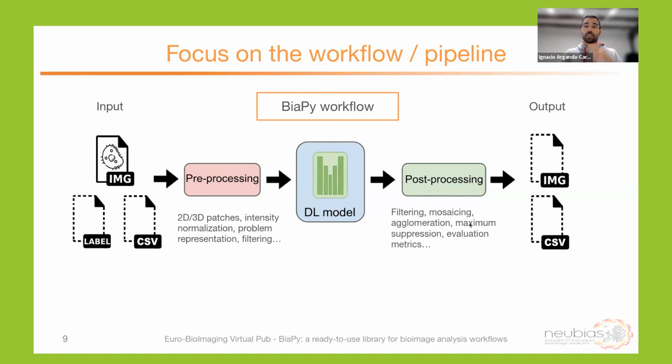And post-processing, as I said, there's a lot of things that we can do. Here, actually, the analysis is also performed in some cases. We have post-processing filtering, but also, very importantly, how do we do the mosaic of the different patches out of the input patches, or we have agglomeration methods, non-maximum suppression methods for detections or segmentations that are nearby, etc. And plenty of evaluation metrics, and we spent a lot of time on that too, because we are focused on the computer science aspect of this, to really quantify our results.